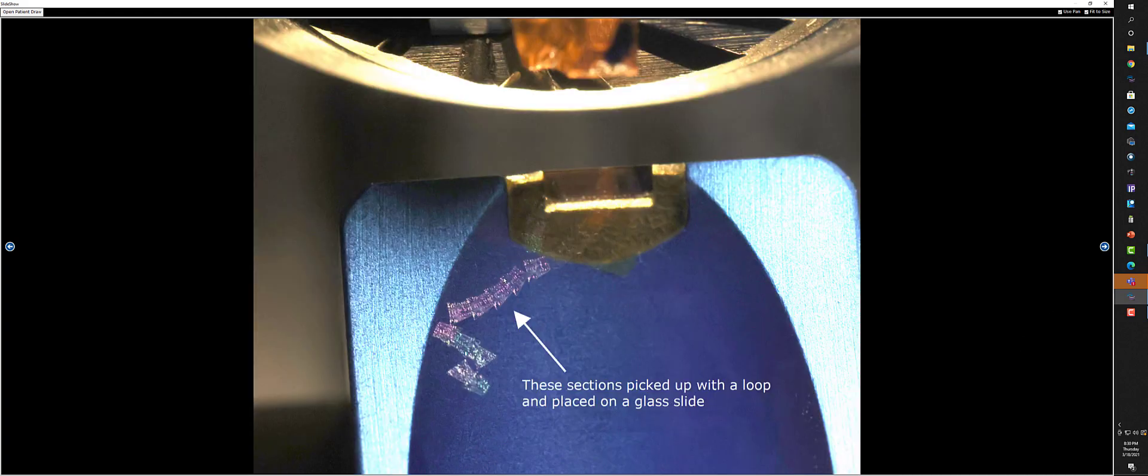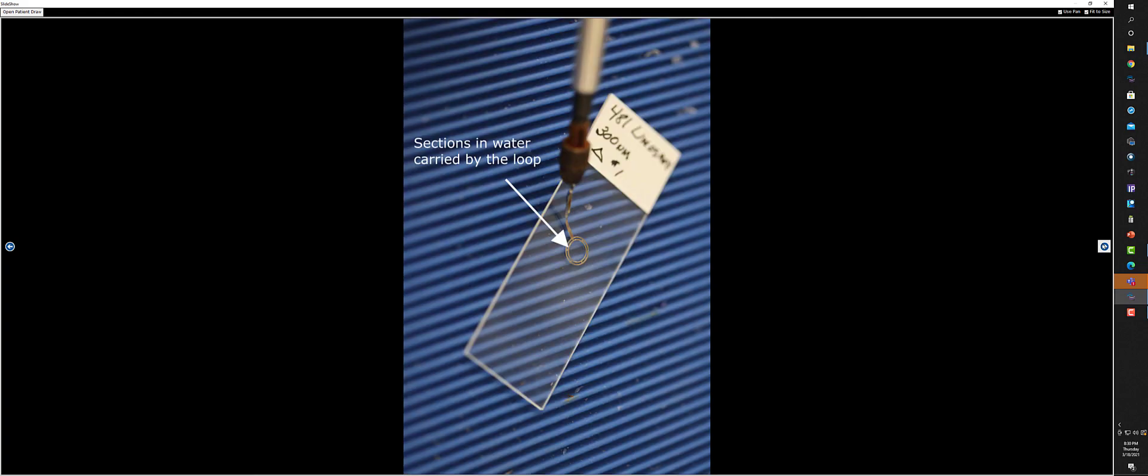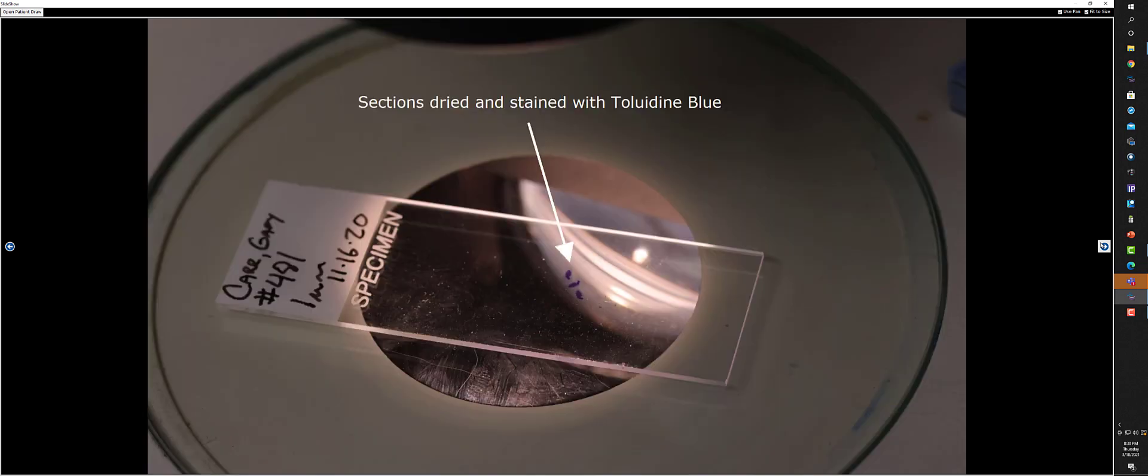These are what we call semi-thin sections, about 400 nanometers thick. We can use that for our survey sections. These are floating on the surface of the water. We're going to pick those up with a loop and place them on a glass slide. And then we're going to stain them with toluidine blue and look at them under a microscope.